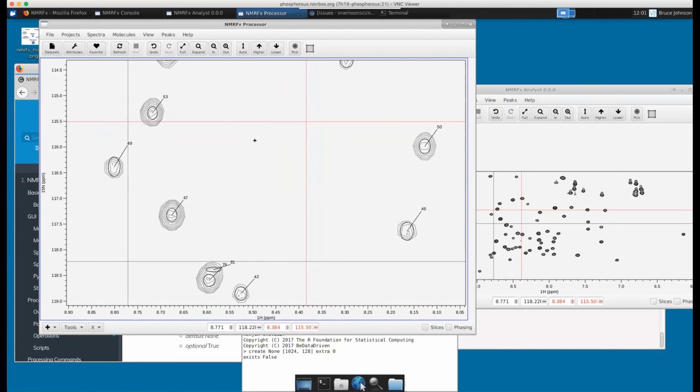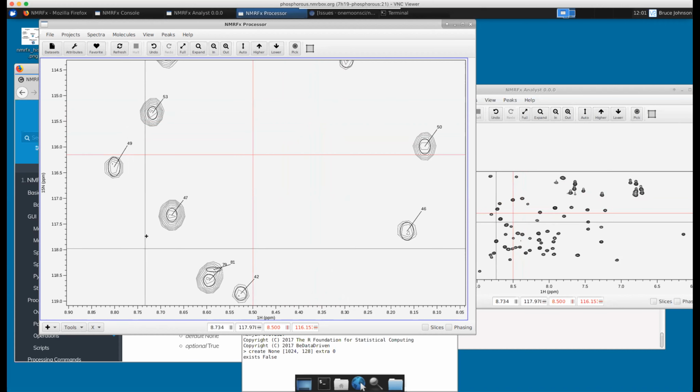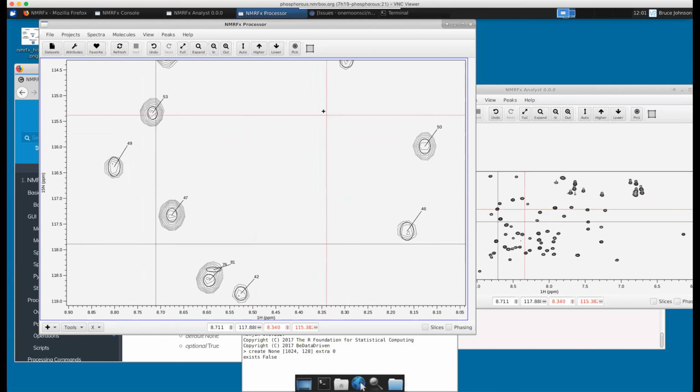As soon as you click anywhere with the middle mouse button, if you have one, the software in some teleological sense says, oh, you've got a 3-button mouse. From that point on, the left button moves the black crosshair no matter where you click, and the middle button moves the red crosshair. Oh. So that allows you to work with just a trackpad or a single button mouse. And if you have a 3-button mouse, you can toggle back and forth.